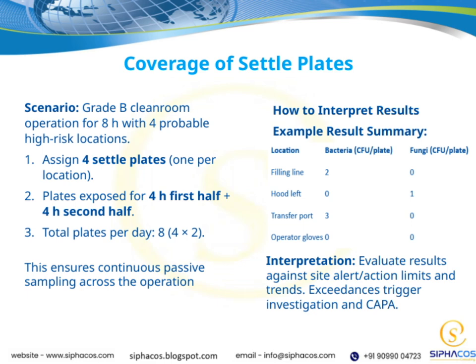This approach ensures we're continuously sampling passively throughout the operation, giving us a comprehensive picture of the environmental conditions over the entire shift. It's a practical way to monitor contamination levels consistently and reliably, and it helps us identify any potential issues early so we can take appropriate action.